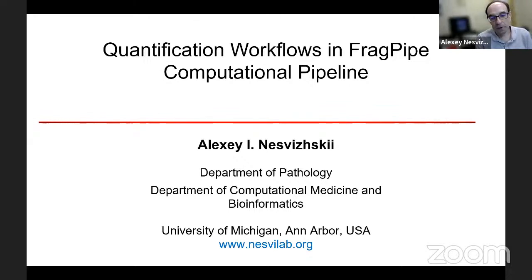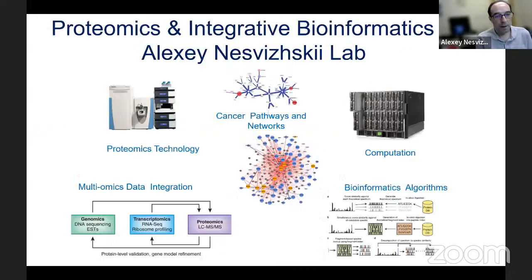I'll talk about quantification and FragPipe, but also give you a brief overview of the whole functionality of FragPipe, including post-translational modification analysis, because this is where we started with developing this pipeline.